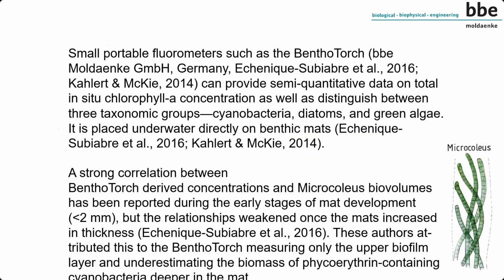And I would like to cite here literature that mentioned the BenthoTorch. They say that it can provide semi-quantitative data on chlorophyll in situ measurements of chlorophyll A and the taxonomic groups. I hope I could explain this quite clearly, and that can be placed underwater also on benthic mats.